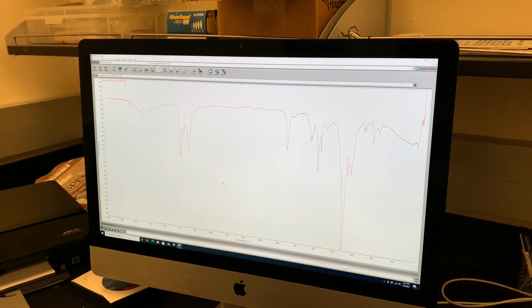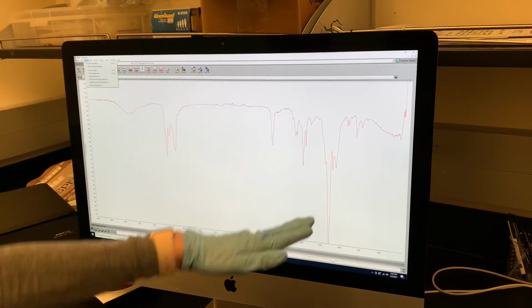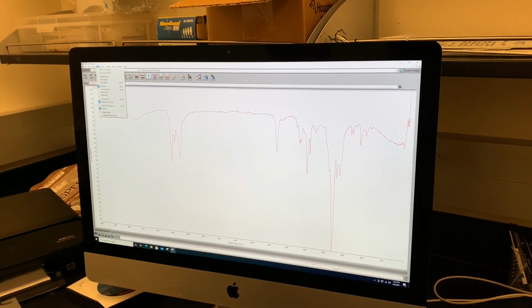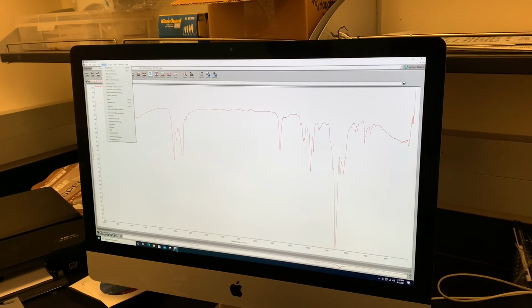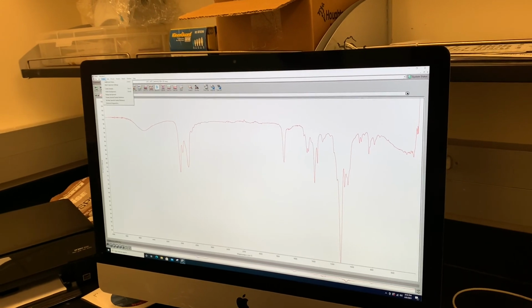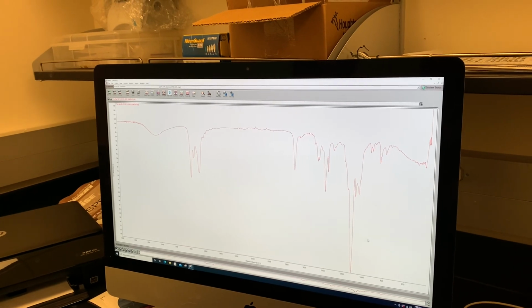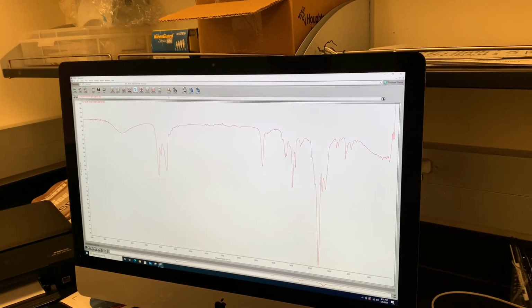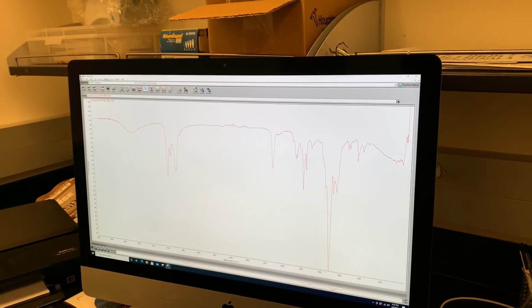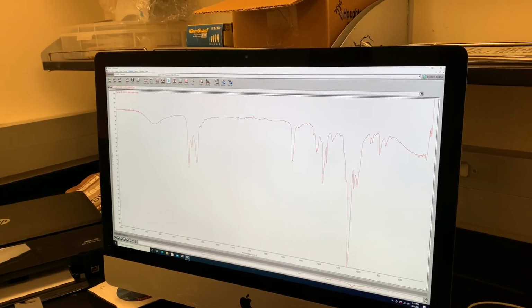All right, turn it around. It actually looks like the absorbance is not that bad. Initially it looks really good, but the scale right now is only going down to about 46% transmittance. So I can change the view to go from 0 to 100. But the peaks look pretty well defined. So I think that this is good enough for us to work with. I'm going to change the scale on this and then save a copy of it, and we'll use this to analyze the product.